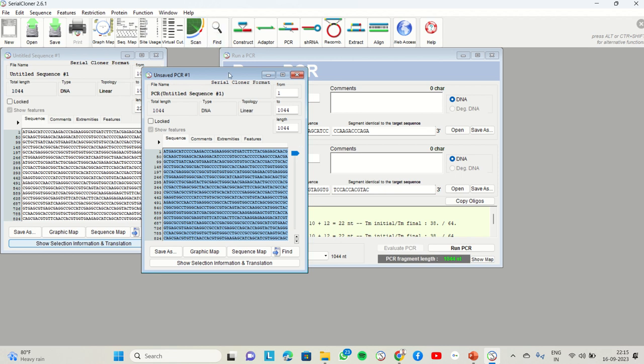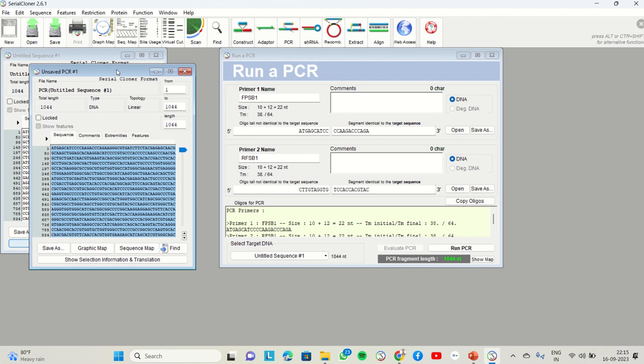Here we are not giving any primer annealing conditions or temperature. Actually, when we order the primers, we go for gradient PCR, where we set a range of annealing temperatures to find out the actual experimentally successful annealing, and then we get amplicons later. But in in silico PCR, we give primers and look for the probable complementary sequences found in the target DNA and their successful annealing within the system, just in silico. We are just running the PCR, and the PCR product will also be 1044 nucleotides in length.